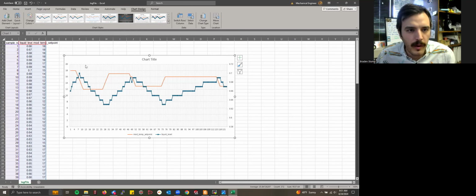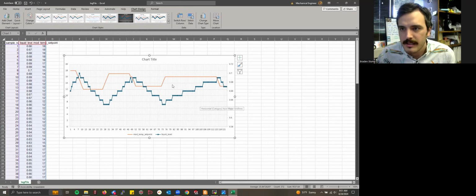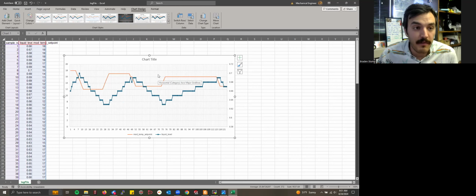from about 0.7 milliliters, which would be 700 microliters, down to about 630 microliters. So about a plus or minus 35 microliter swing in this case. So not terrible, not as dialed in as it absolutely could be, but definitely much better than if you were to try to run a sample without this sort of control present.